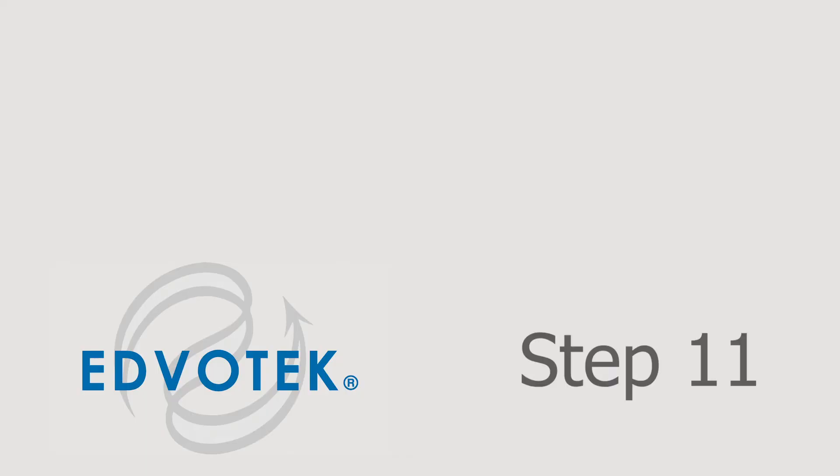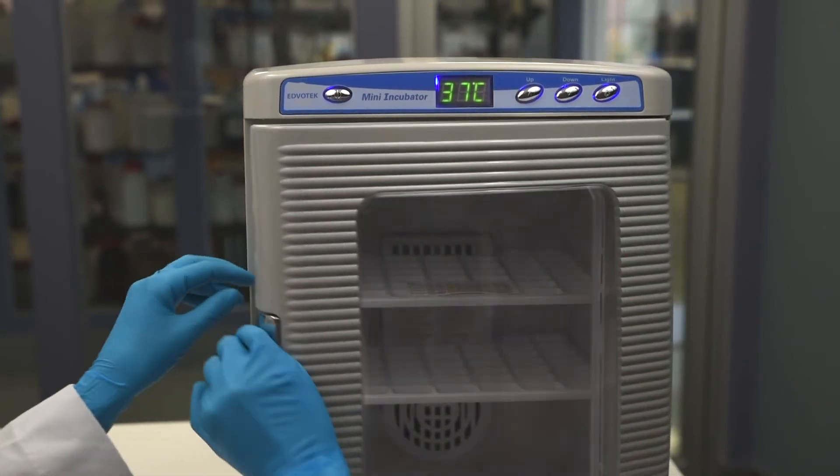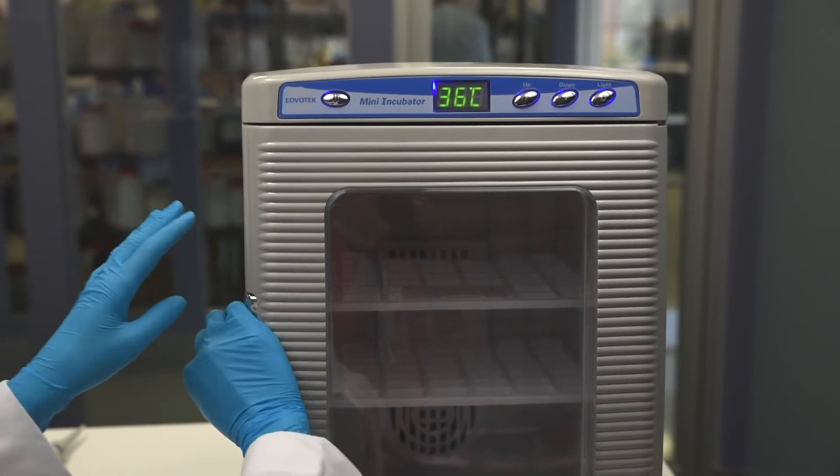Step 11. Incubate the microarray card in a 37 degrees Celsius incubator for 5 minutes or at room temperature for 10 minutes to allow the samples to completely dry.